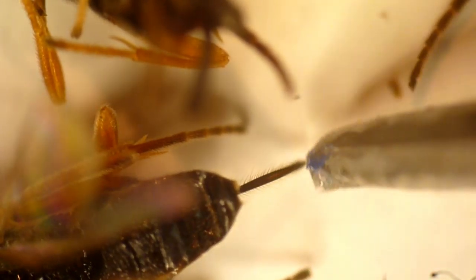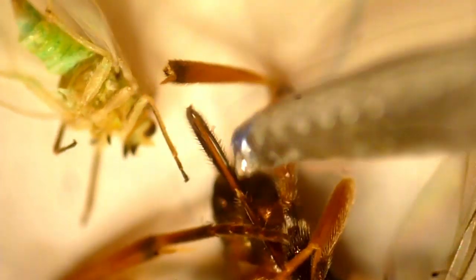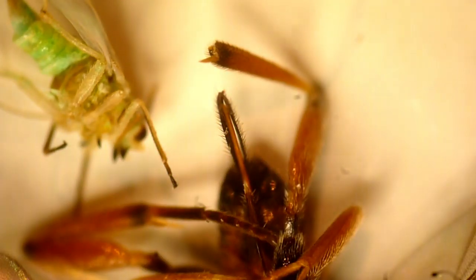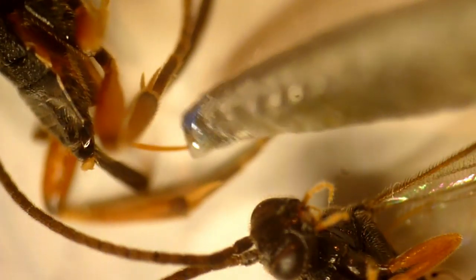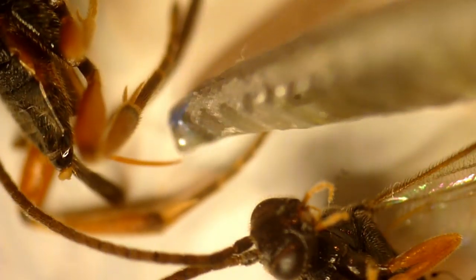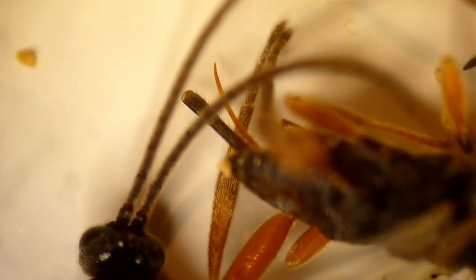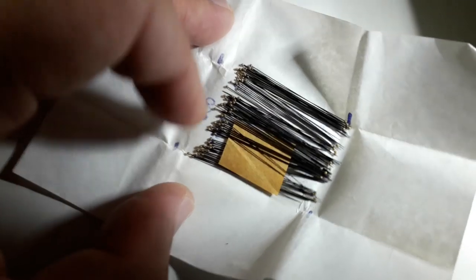I'm now using my tweezers on the right side to point to one of those stingers. You can see it's relatively large. This one is lying on its back, and you can also see the stinger exposed - quite a long structure compared to the overall insect. Yet another one here with the stinger more exposed - it's really quite pointed and sharp and also slightly bent and round. The last one is over here, also easily visible. The antenna of these wasps are also quite large, remarkably large.